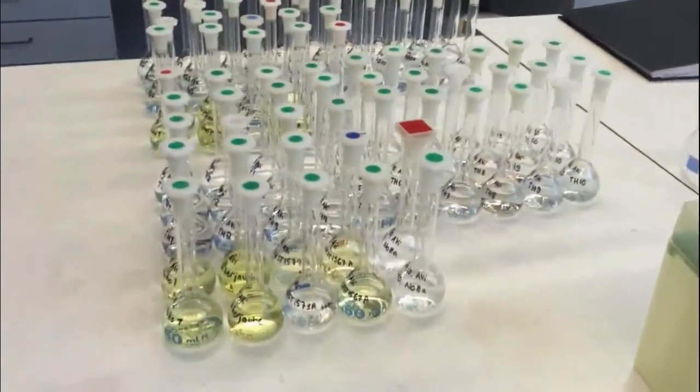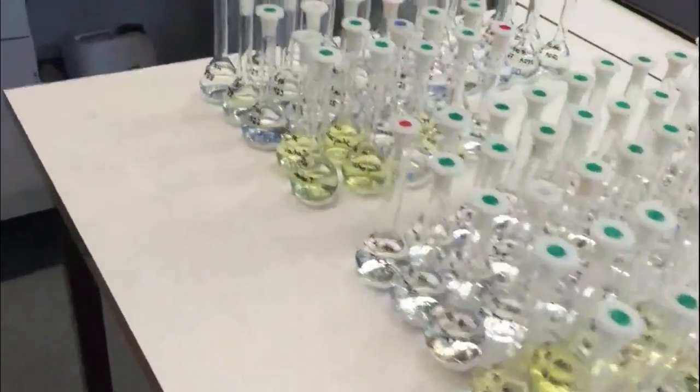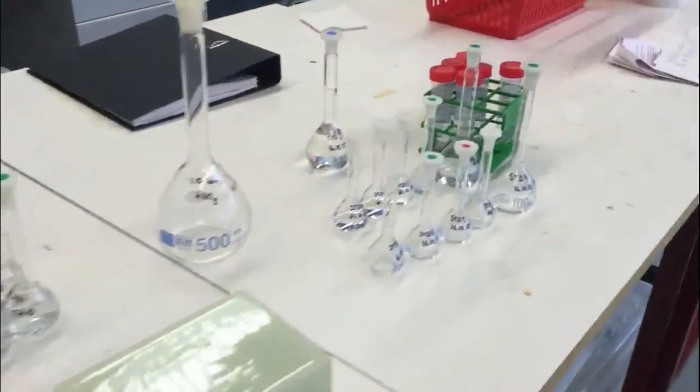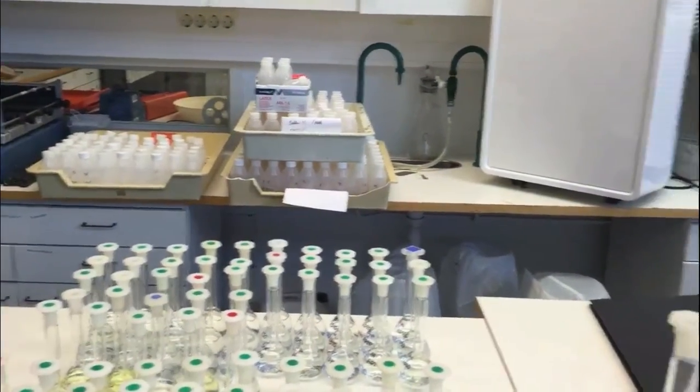Here are the volumetric flasks in which we diluted our samples, and these are our standards and rest of the samples. At this stage, lab work is over. The results are partly analyzed and I'm working on discussion chapter.